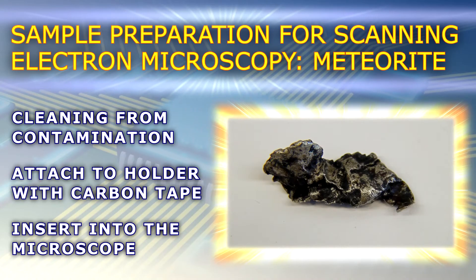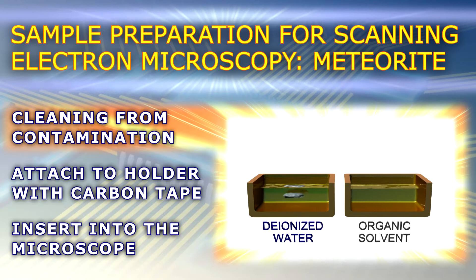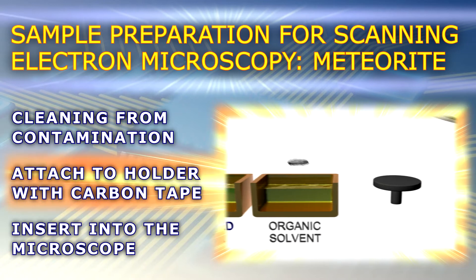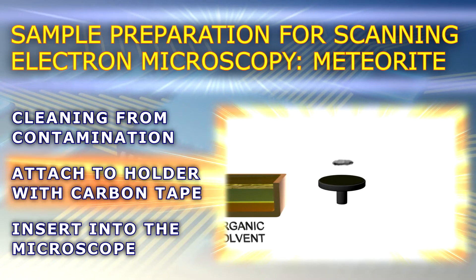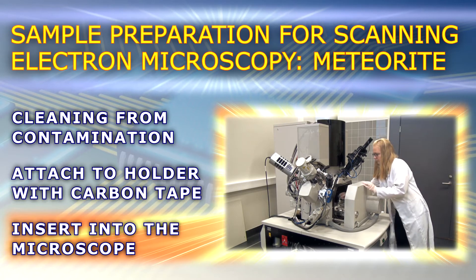So, let's get started! The meteorite has a metallic appearance and therefore it should be safe to clean it from contamination with deionized water and organic solvents. Finally, the sample is attached to a mushroom-shaped holder with carbon tape and inserted into the microscope.